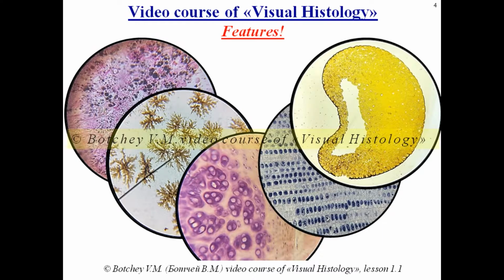The piquancy of my course is a special section, which I called Walk on the Histoslide. This is an interactive study of the slide.